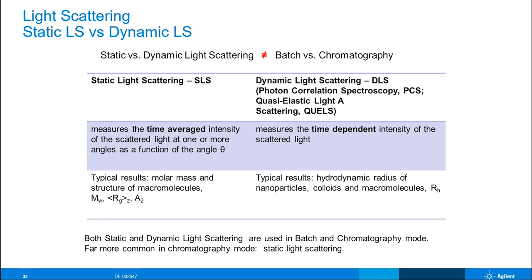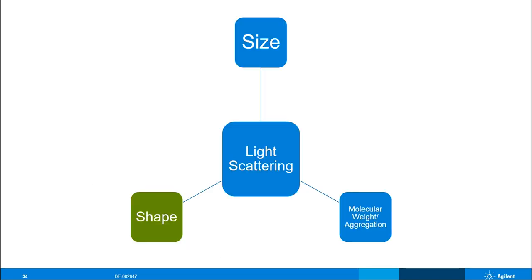So what do these radii mean? We know that from static light scattering, we can determine the radius of gyration, and from dynamic light scattering, we can get the radius of hydration. Both of these terms are different. Looking at this lysozyme molecule below, we can see that drawing out these different radii, hydrodynamic radius and radius of gyration occupy different areas in space.